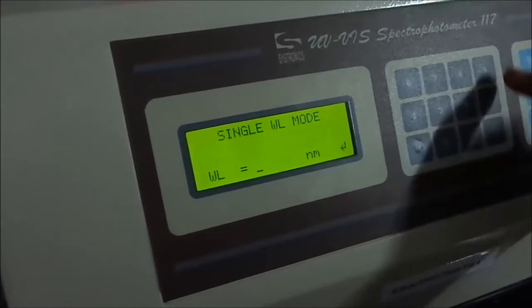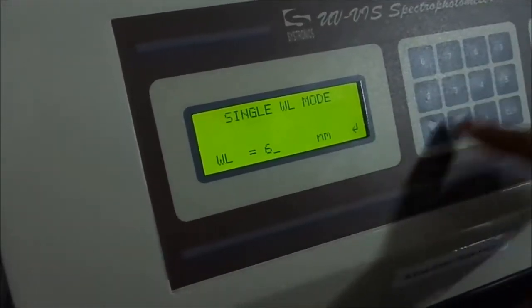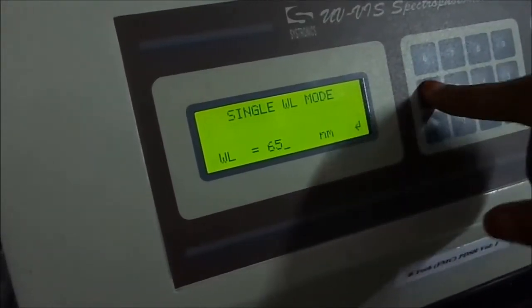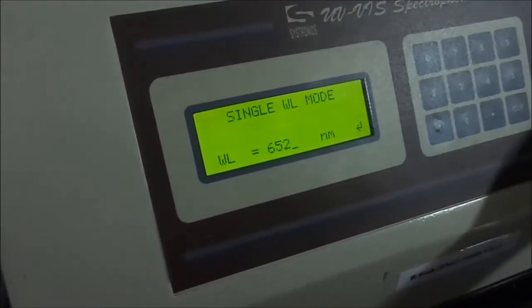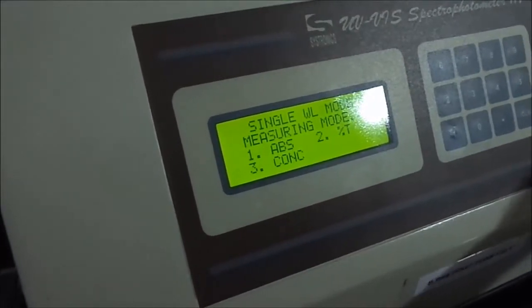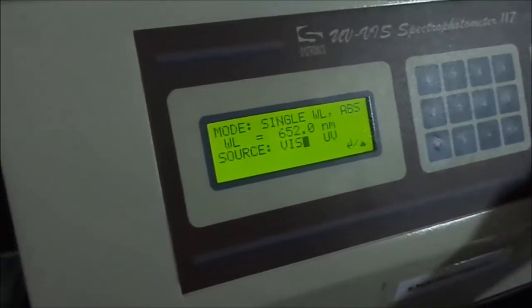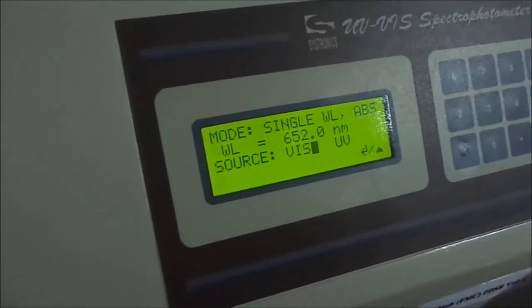The volume of the supernatant solution is made up to 25 ml using 80% acetone. The OD value is measured at 652 nm in a spectrophotometer and used to calculate the total chlorophyll content and chlorophyll stability index.